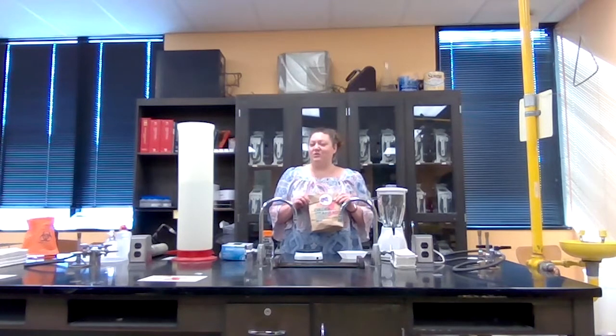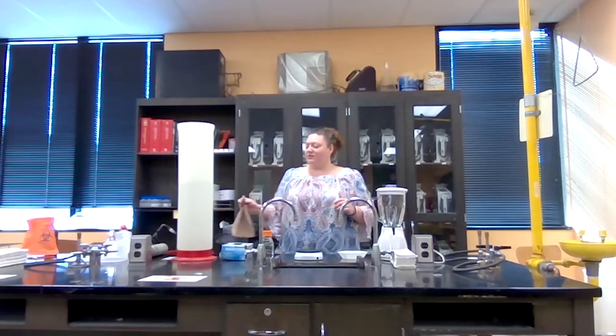I'm assuming probably a lot of you, if not all of you, are very big fans of Taco Bell. Many people are. They have a very diverse menu, so people usually like at least something that they have. But today we're just going to test the humble taco, the regular old taco, for microbes. To begin, we need to weigh out a certain amount of our taco, and that amount is going to be 20 grams.